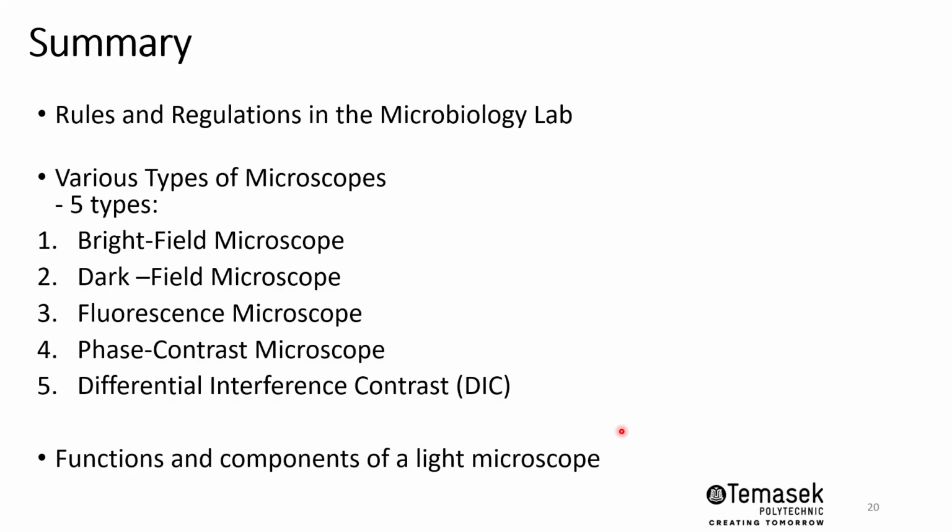100 times magnification, right? So with your objective lens at 100 times magnification, often you will need to use the immersion oil as well, so that you can produce a clear image for you to visualize your specimens. So this is the end of part 1 for topic 2.